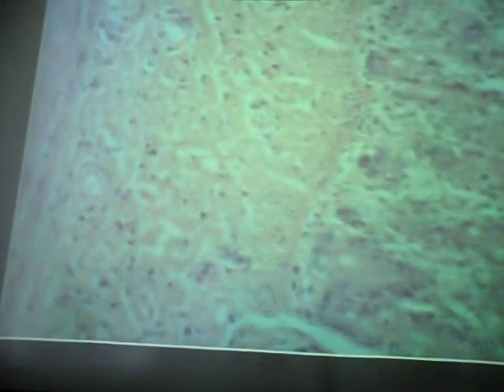All right, one last thing. What you saw again yesterday. Now, remember there are lymphatic nodules or follicles in various parts of the body. And that's part of what we call what? The MALT, which stands for mucosa-associated lymphatic tissue. Not mucus, but mucosa.